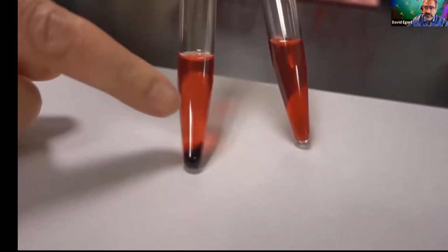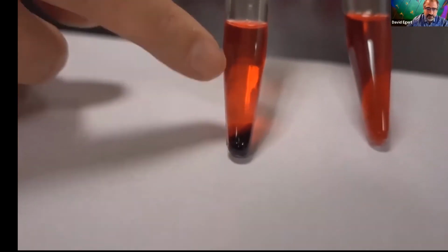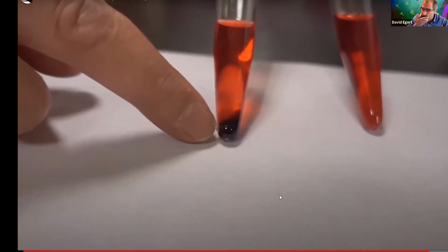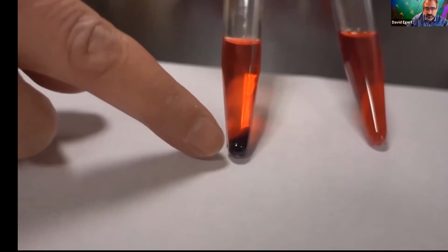And then finally we have the glycerol, and we have two different conditions here. We can start with this one here. This is the glycerol where the cells were only in for a few minutes before we spun them down. And we can see some of the cells lysed. There's red here. That means some of the hemoglobin escaped into the solution. But there's a pretty well-formed pellet, which is telling us a lot of the cells actually did not break apart and then got pulled down, completely to the bottom of the tube.